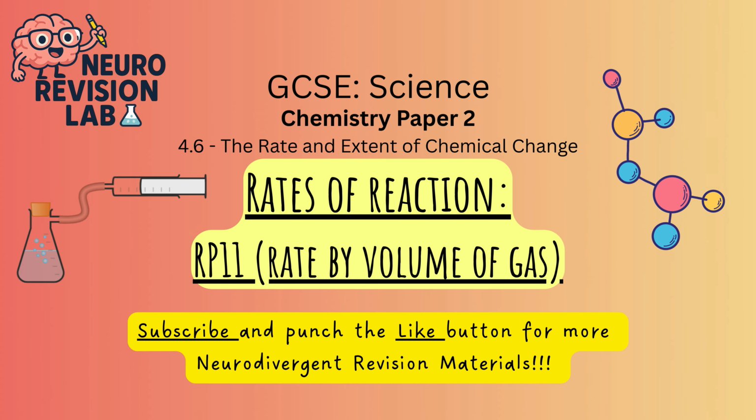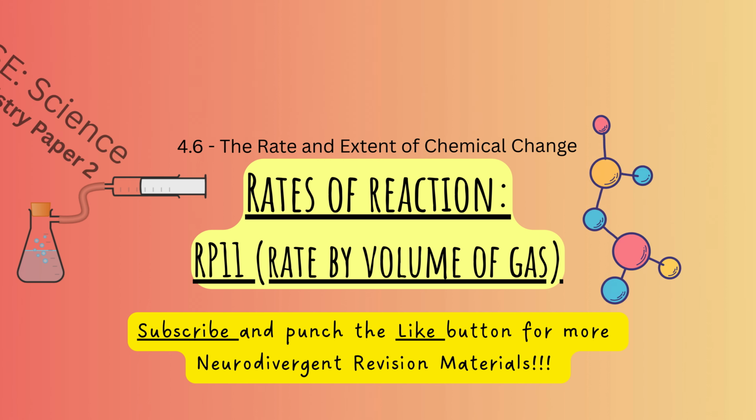In this video, we're going to take a look at one of the two possible rates of reaction required practicals. This is required practical 11. This one focuses on measuring rate by volume of gas, which you may recognize from the equipment, either a gas syringe or an upside down measuring cylinder.